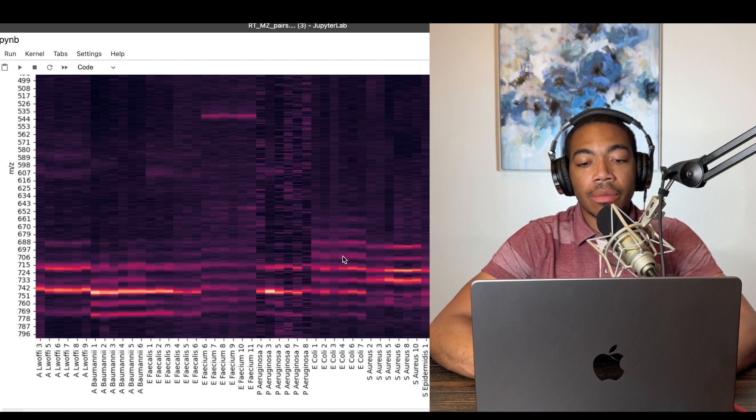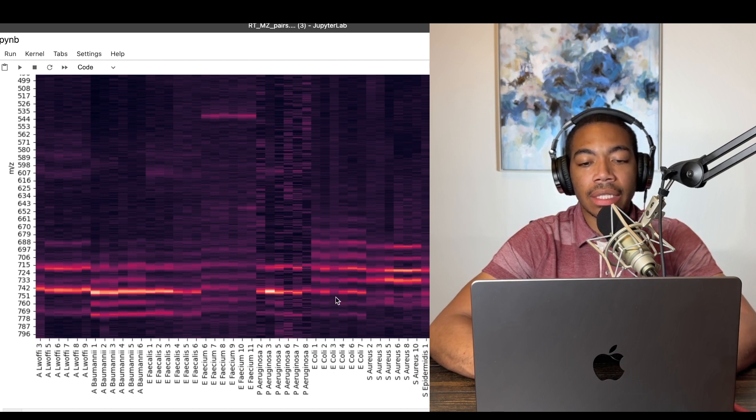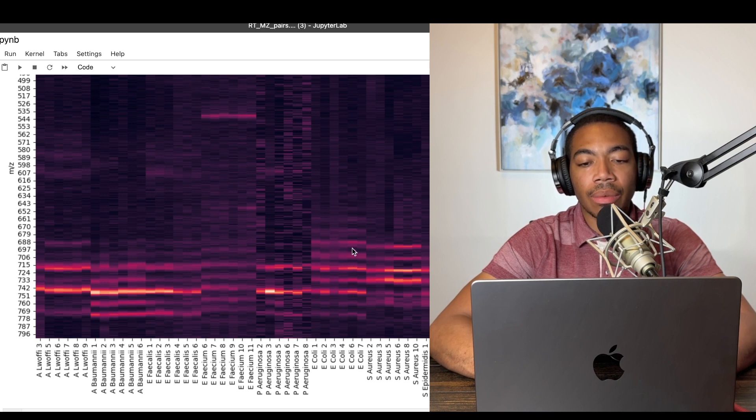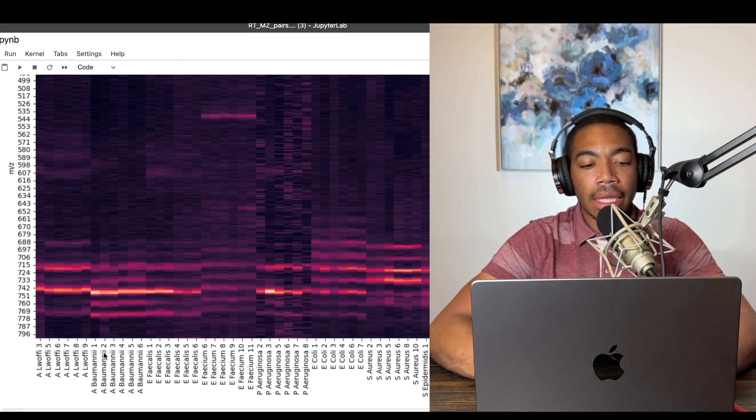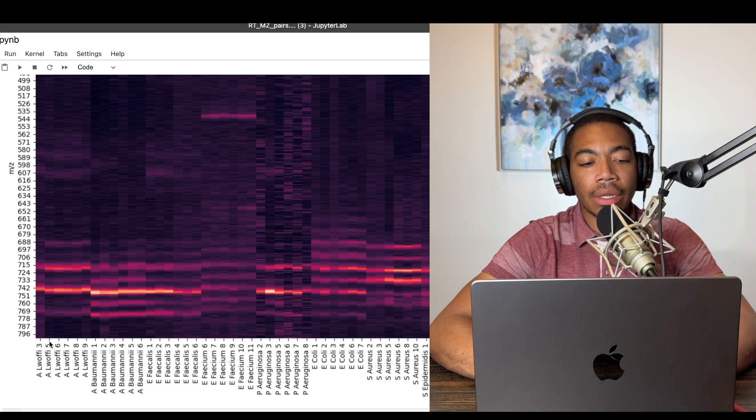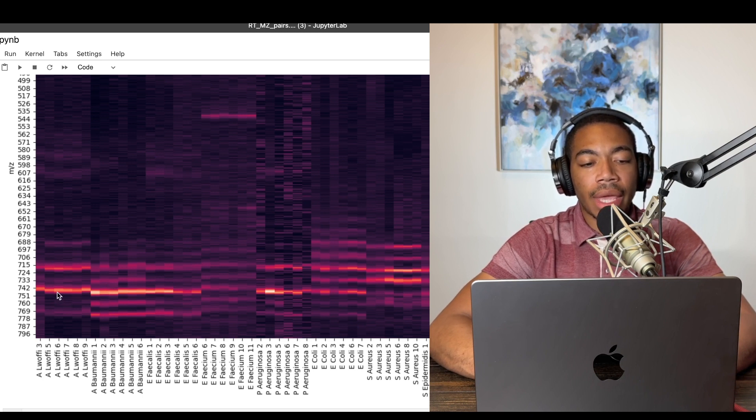Also, it's more clear that you can see how some of these patterns exist. So the E. coli has a certain band that's consistent with the fatty acid signal. So the Pumani also has a similar type of band, whereas this Lawafi has a distinct pattern.